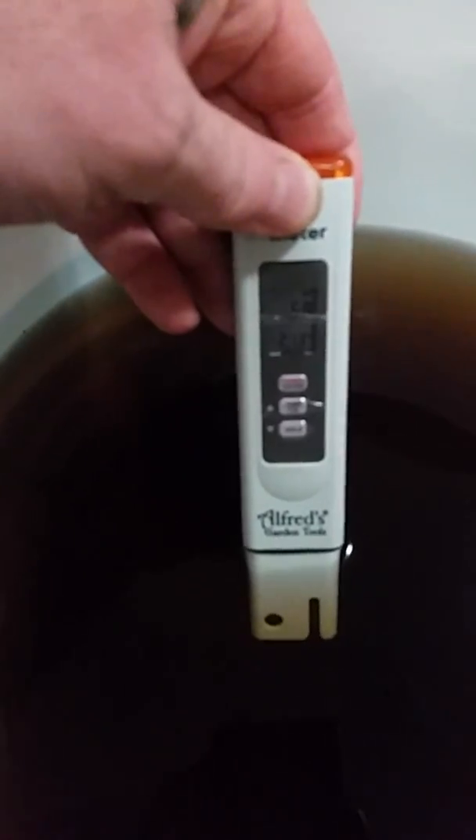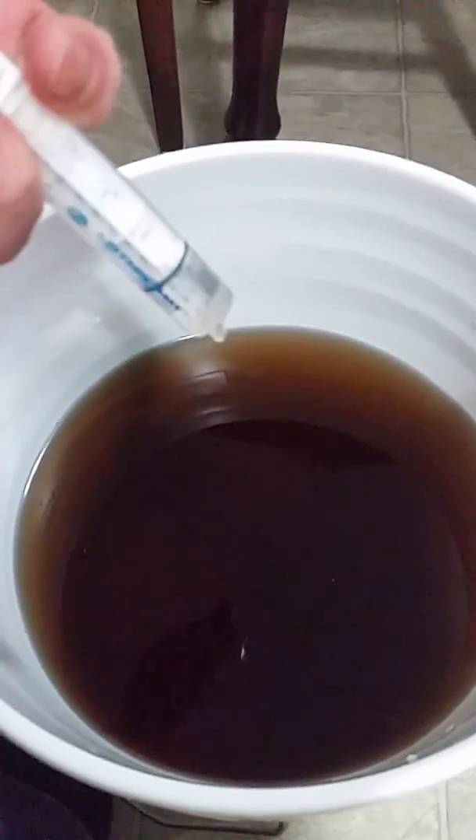I'm going to check it out here in my mixture. I'm at 5.7 — because it's a little thick of a mix — 5.8. So what I'm going to do is give two or three little drops of that and give it a good stir. I'm going to give it a little bit of vinegar.